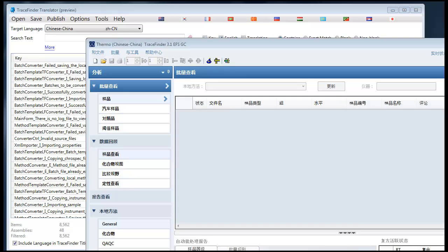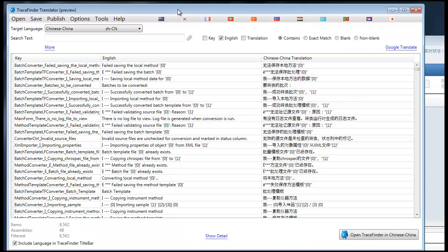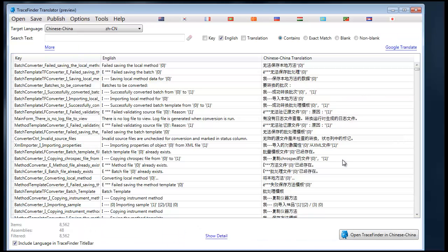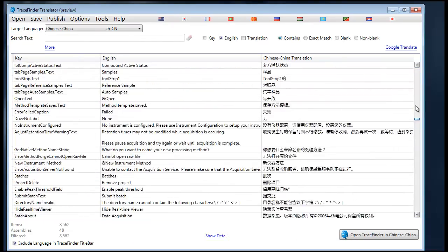In this video we're going to introduce TraceFinder Translator, a utility that allows you to translate TraceFinder into the language of your choice. We're going to go through the basic functions of TraceFinder Translator and show you how to use it. Let's first of all go ahead and, to set the context, run TraceFinder Translator and show you what TraceFinder looks like in Chinese.